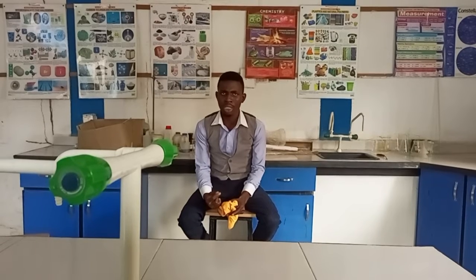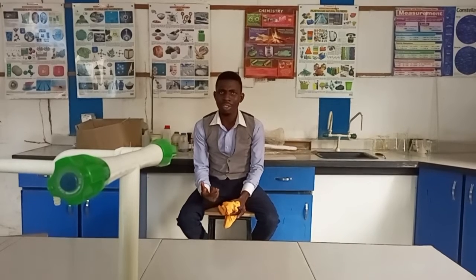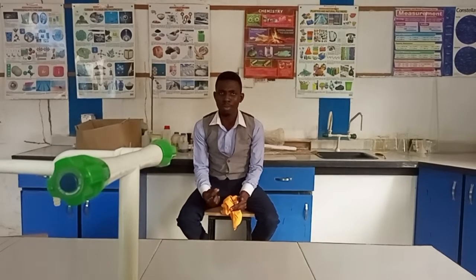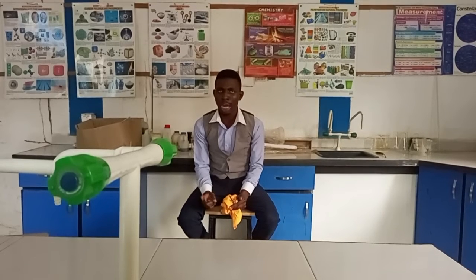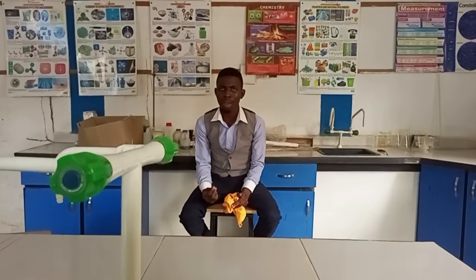Now before I proceed again, I would like to mention some certain areas that are also very helpful. When you are using methyl orange as your indicator, what will be the colour at the endpoint? That can be another question. What will be the colour of methyl orange at the end of the reaction? If you are titrating a strong acid and a strong base, and you are making use of methyl orange, what will be the endpoint? For methyl orange, at the point at which neutralization occurs, there will be formation of an orange colour.